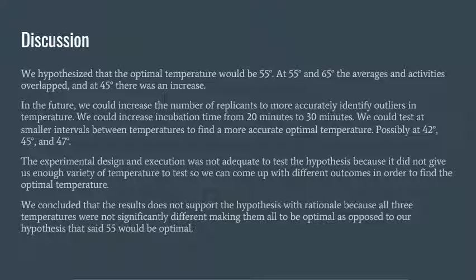If possible, the temperatures would be at 42 degrees, 45 degrees, and 47, so as to give ourselves a gap of differences to see what the optimal temperature could possibly be.